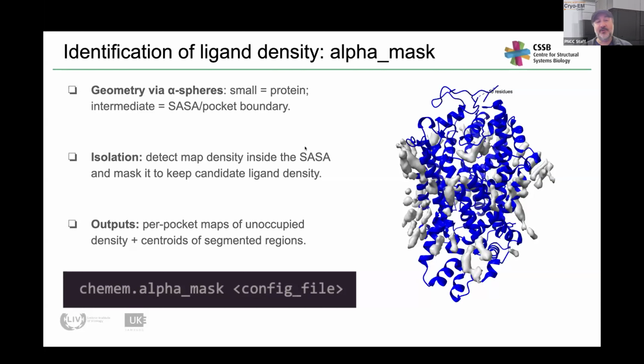What is the lowest resolution map one can effectively use? And to add a little bit to that, as one uses lower and lower resolutions, do the stereochemical restraints get weighted more and more heavily? I mean, we haven't really tested TEMPy-ReFF below 10 angstroms.